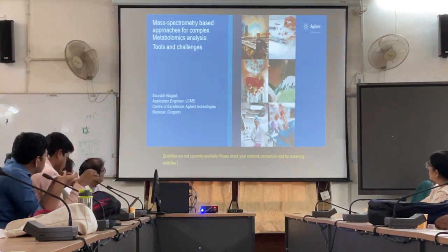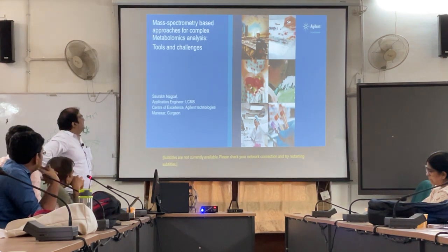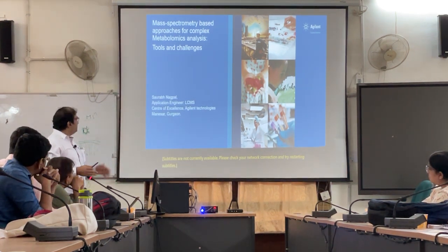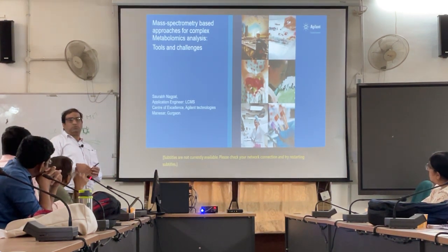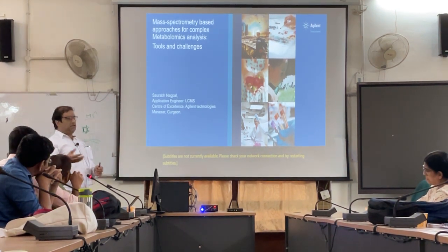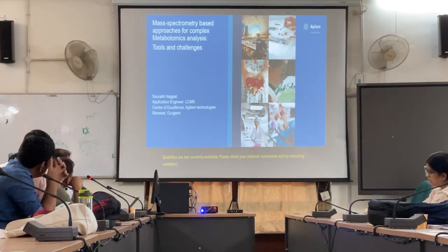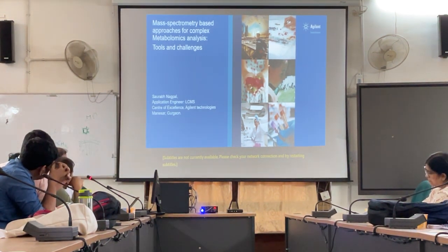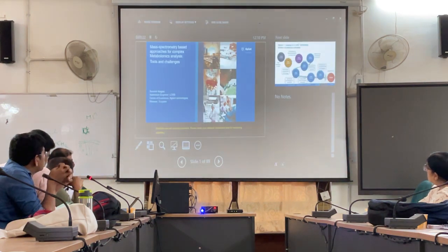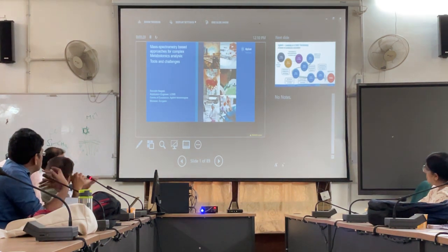Thank you. So I think the topic is mass spectrometry based only, but we will not go too much into mass spectrometry because in 2-3 days you will see the instrument, then things will become more clear. What I want to show you is how the data actually looks so that you can interpret.